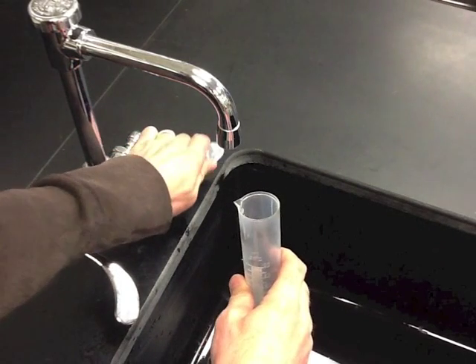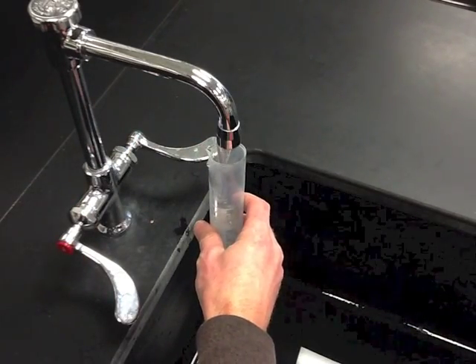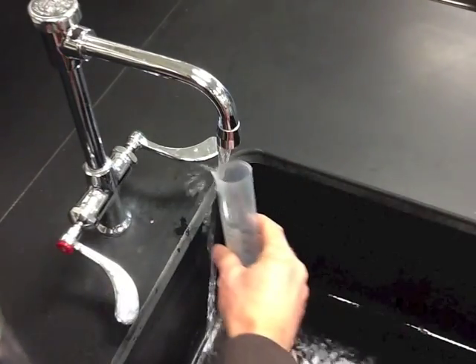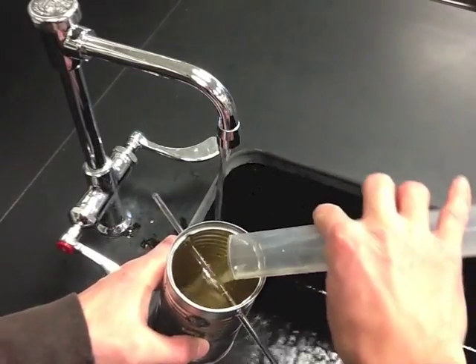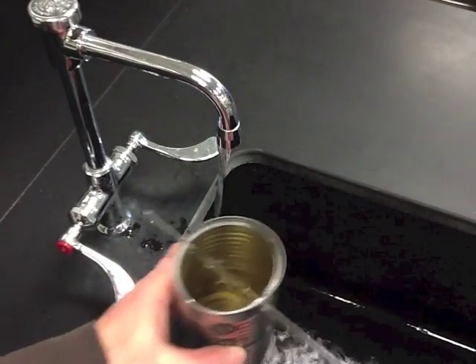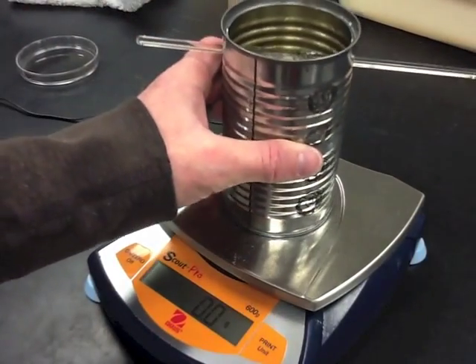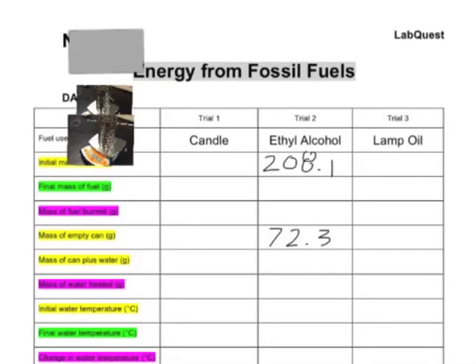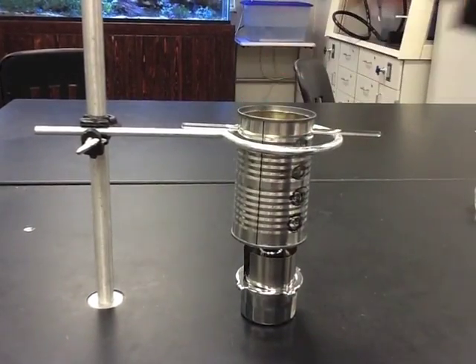Go ahead and add about 200 milliliters of cold tap water. It doesn't have to be exact because you're going to weigh it anyway. There's 200 milliliters. Weigh the can now that it's got the water in it, then put the can back on your apparatus.